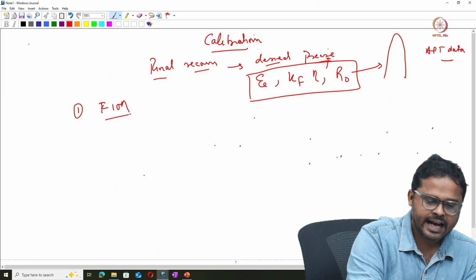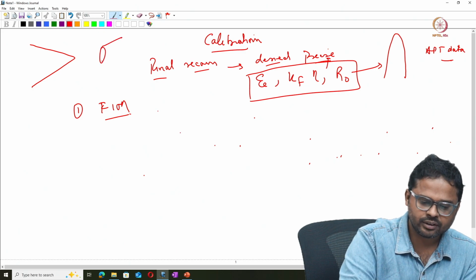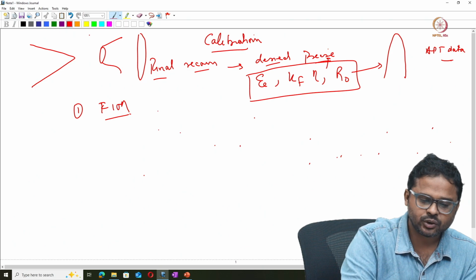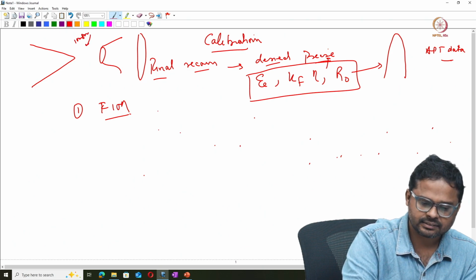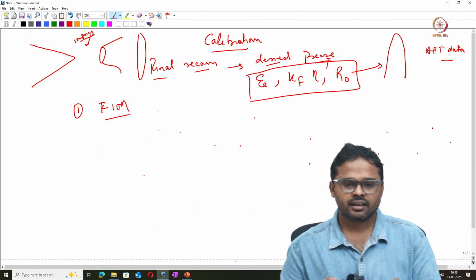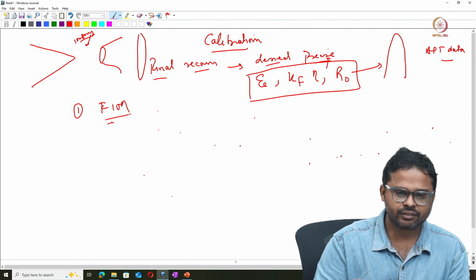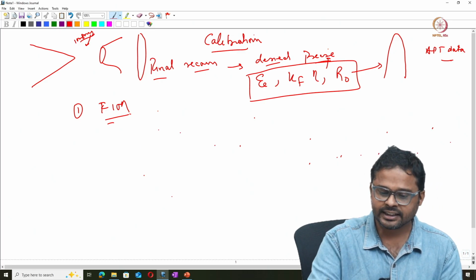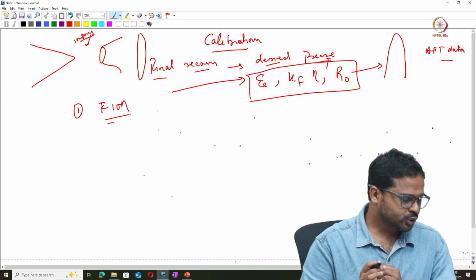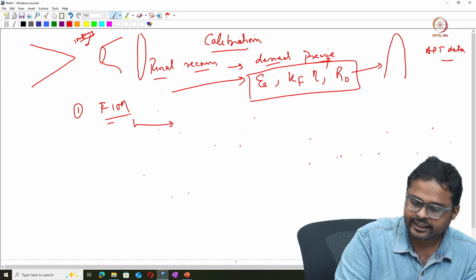In an atom probe tomography instrument, there is a counter electrode and a detector, so you can actually use the imaging gas in the same instrument and do field ion microscopy, FIM, at the start of the experiment to determine these values. FIM can be used to determine the reconstruction parameters.